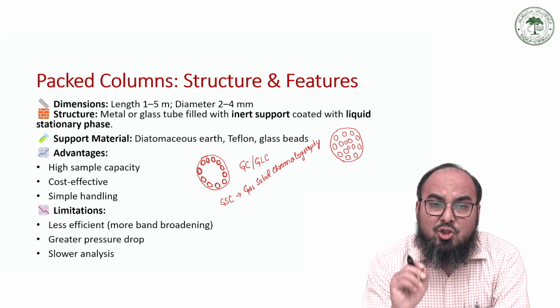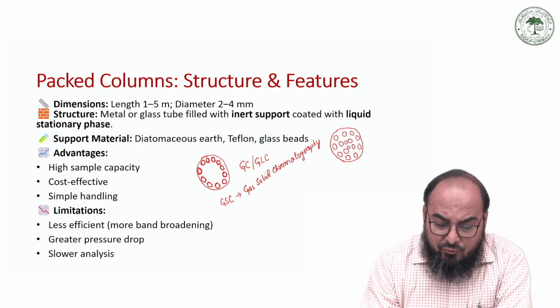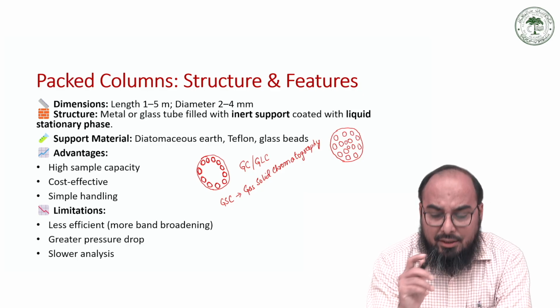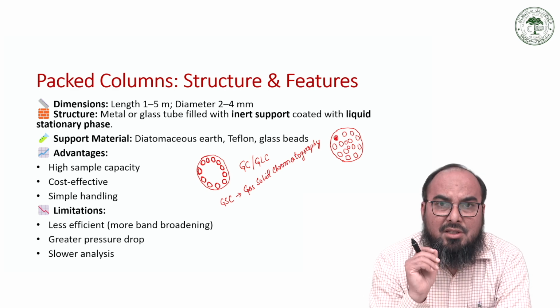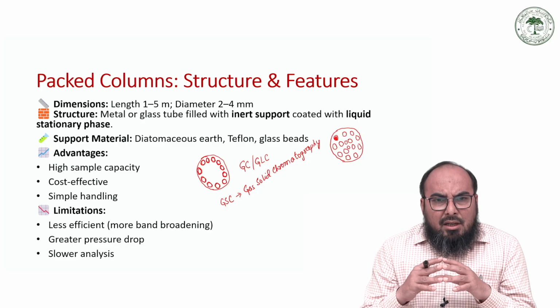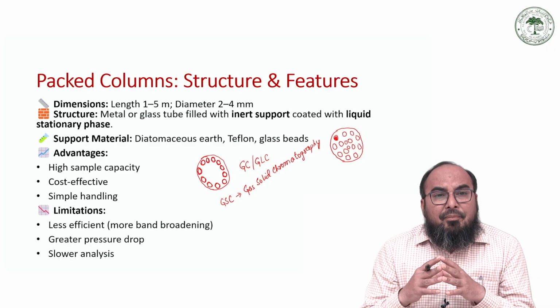Generally, for the packed column, the solid stationary phase is diatomaceous earth.